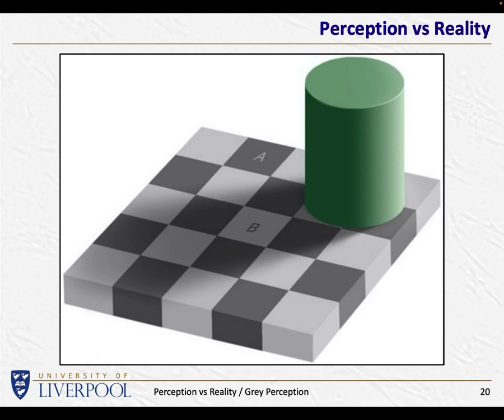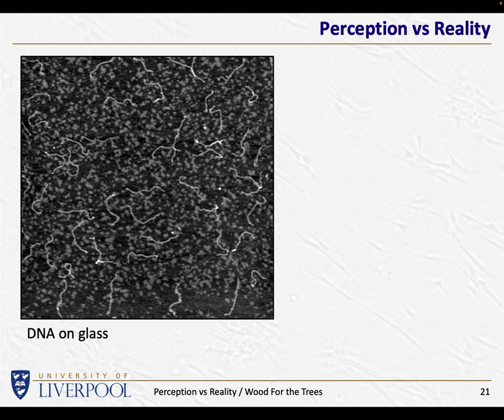When you look at an image, whether it be, I've just taken this image of a whole load of molecules on the surface, isn't it fantastic, look at this, you have to be careful, because what you see in an image is not necessarily what's there. We have to use scientific analysis to tell us what's actually going on, and sometimes human perception is very valuable, sometimes human perception is very confusing. And I haven't got time to talk about all the details because I'm getting a little bit behind schedule.